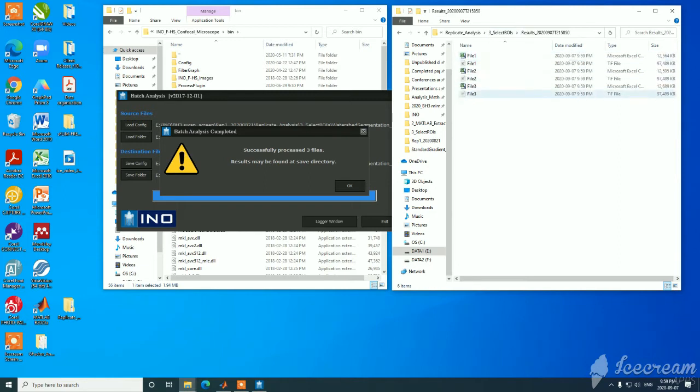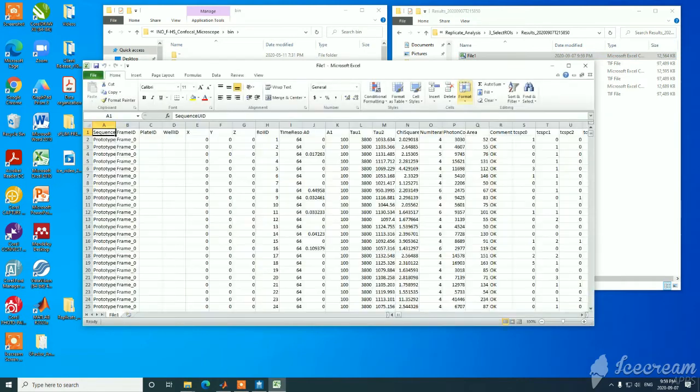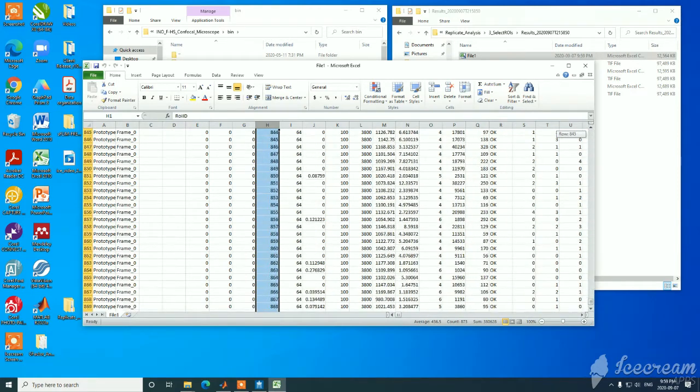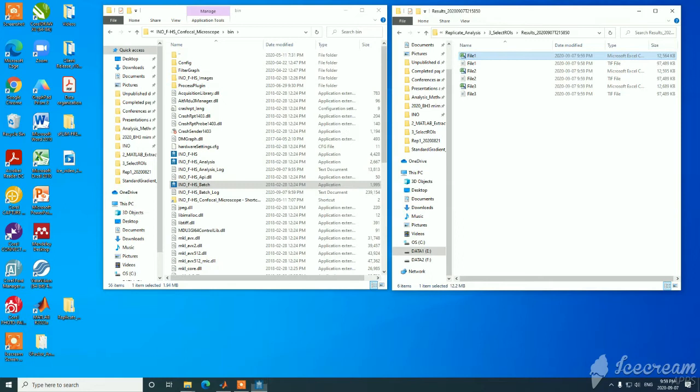And as you saw before with the protein gradients, each has a file that has been exported. But in this case, we have a lot more ROIs. Since you saw in the algorithm we chose, in the image, there were many ROIs within the cells. So that concludes the ROI analysis.